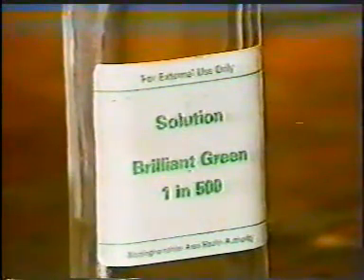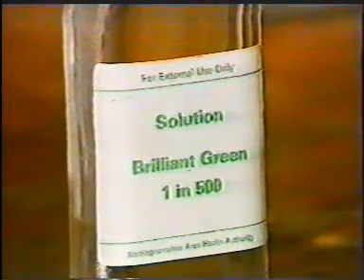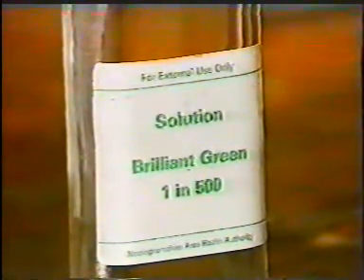Next, it is necessary to carry out tests for identity. Labelling errors are rare, but they do occur, and they can only be detected by testing every container. One example that has been reported was acetic acid labelled as hydrogen peroxide.